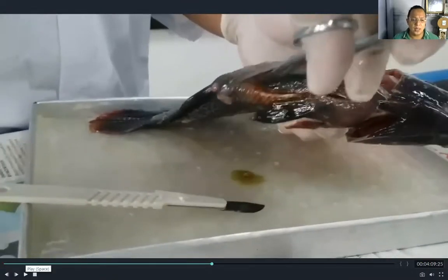Using scissors, cut vertically from the anus of the fish going to the lateral line, and then cut horizontally going to the operculum, then open it downward. This way, all the sides of the fish are cut so that the different internal organs will be exposed.